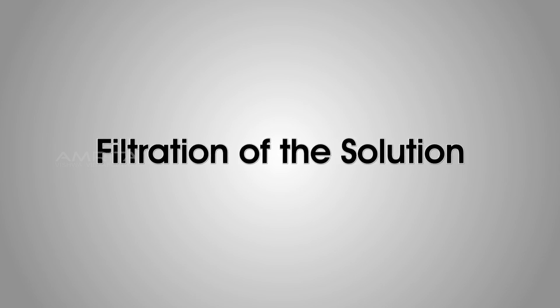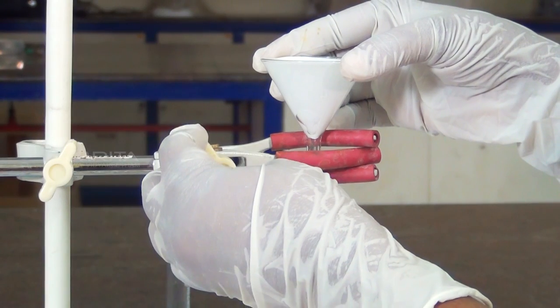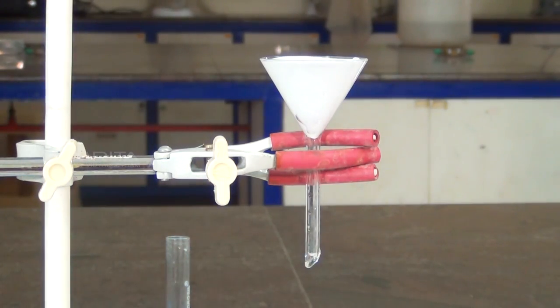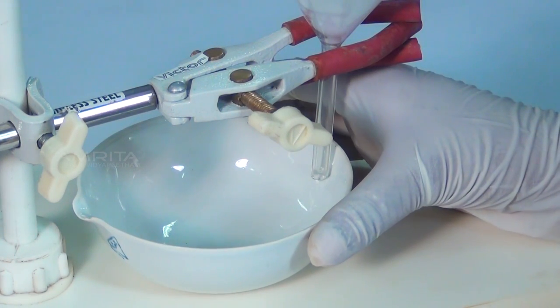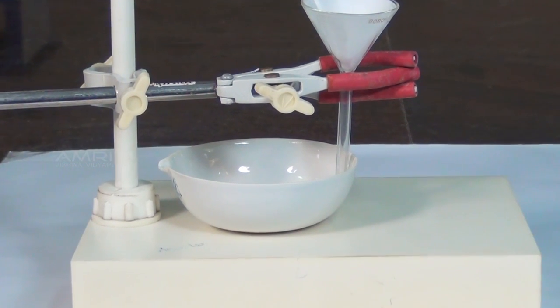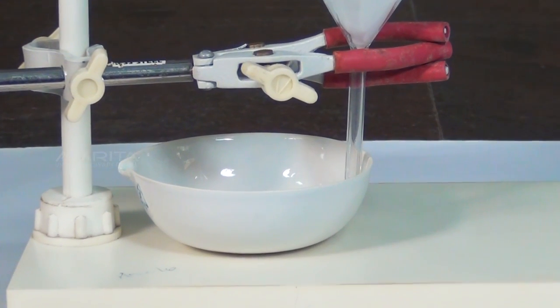Filtration of the solution. Clamp the funnel in which a filter paper is fixed to the stand. Place the china dish under the funnel. The stem of the funnel should touch the wall of the china dish to avoid the solution splashing out.